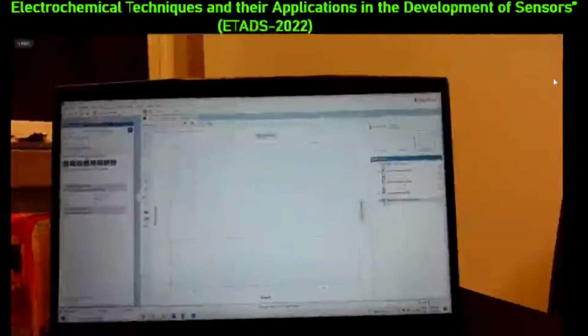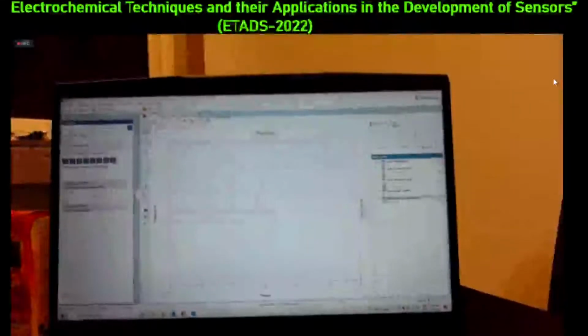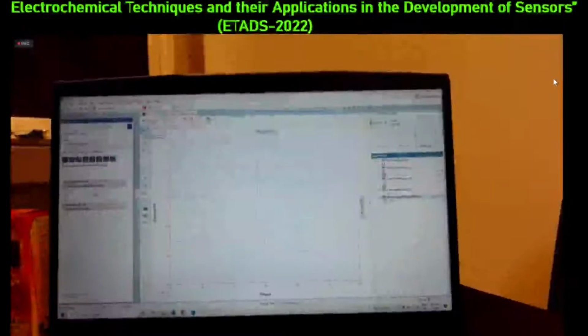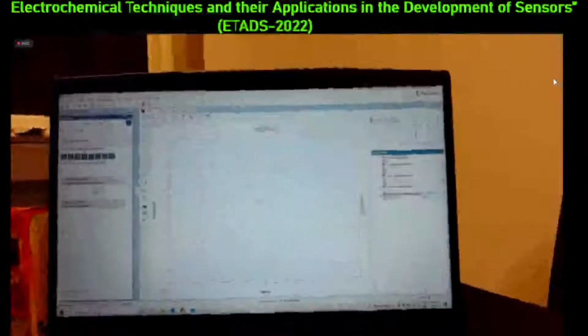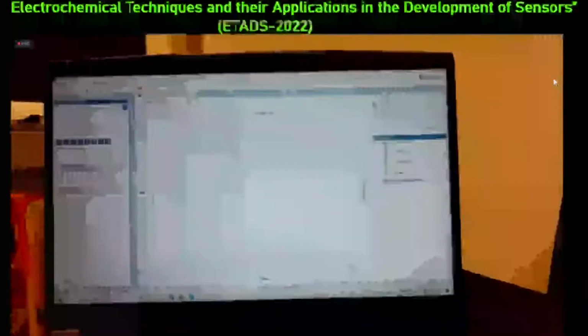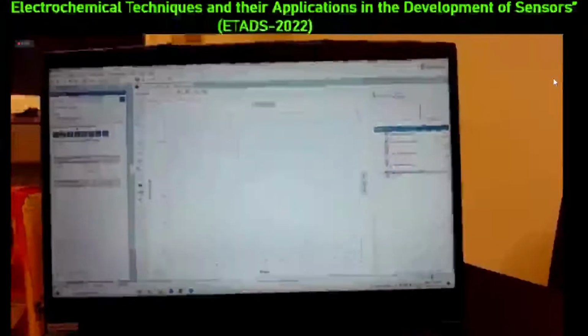And now as I change it, so there was no change here. Sorry for this. It might be that, yeah, there you go. There's a slight change there. You have to zoom more. So now we are in a more basic solution. I'm going to move it. This is now actually pH 9.